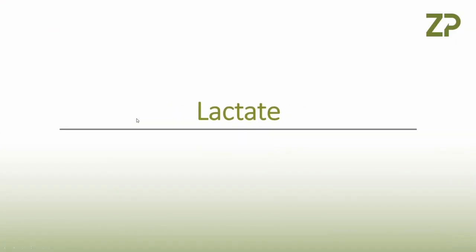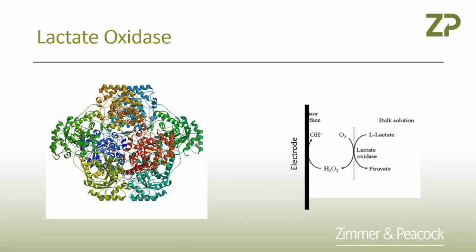Just to say, a lactate sensor is exactly like a glucose sensor, except rather than using glucose oxidase, we're using lactate oxidase. So lactate reacts with the enzyme to form pyruvate, and oxygen generates hydrogen peroxide. So a lactate sensor reacts like a glucose sensor.